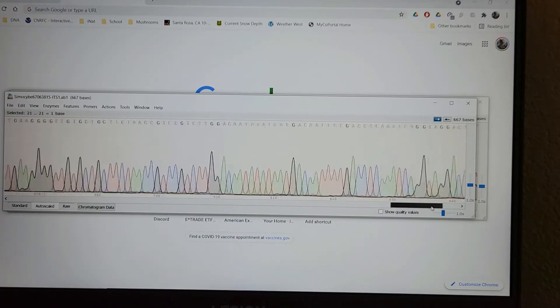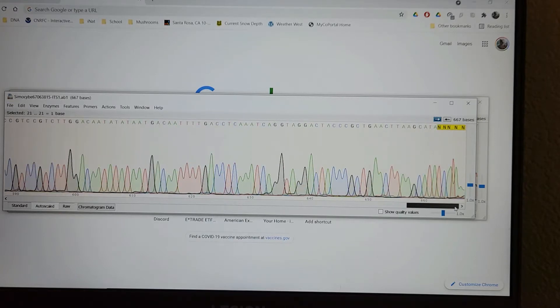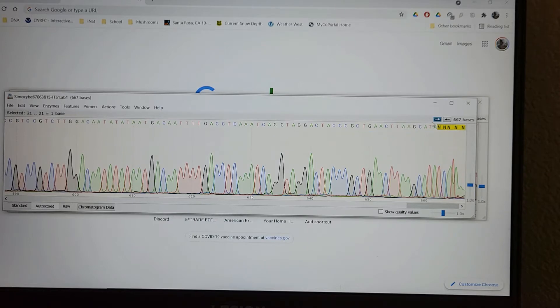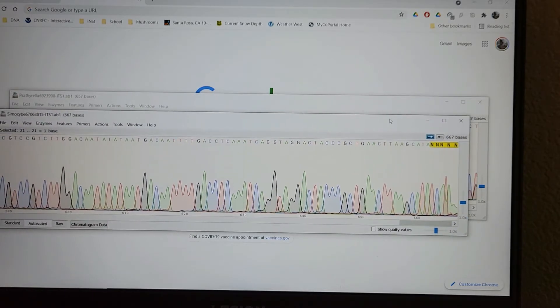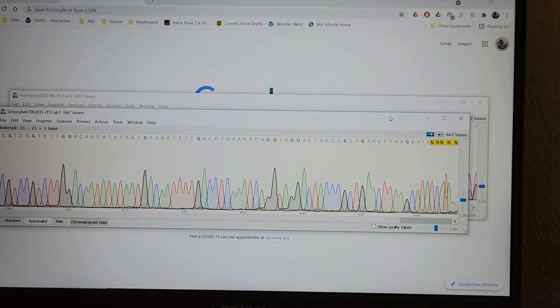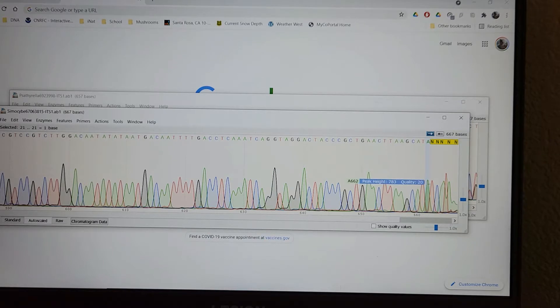And then we scroll all the way to the end of the sequence, and then we see a couple of these. Now N just means that the software didn't know what base to call it. So in this case, the quality scores are just too low.